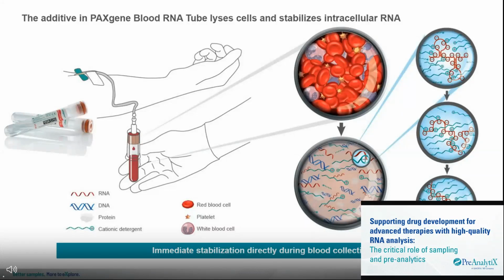And then we see additional effects. So the RNA is protected by binding to the cationic detergent. This detergent is positively charged and it binds to the molecules, and the hydration shell gets stripped off and leads to the precipitation of RNA and other biomolecules, such as DNA and proteins. This takes 2 hours at room temperature, and the precipitates can later be harvested by centrifugation.